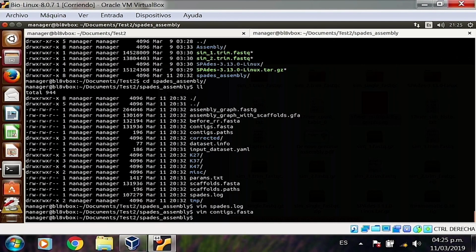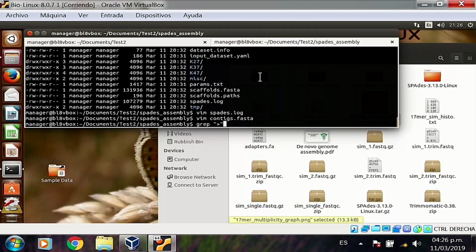We're going to use one of the most used commands in Linux. It's called grep, G-R-E-P. If you want to find the occurrence of a word, of an expression inside of your file, grep will help you. Don't push enter yet. I want to explain what we're doing. Basically, grep is global regular expression, capture the regular expression. But what regular expression?